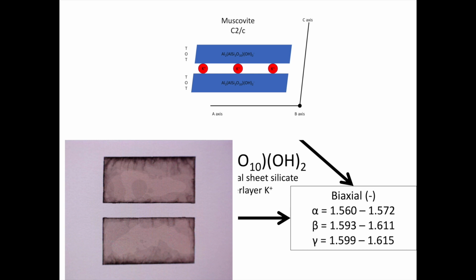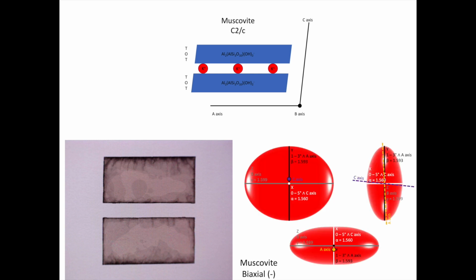However, it does not provide sufficient information to fully orient our Muscovite plates. For that, we also have to examine the optics. We first reviewed the theory behind our optical indicatrix for Muscovite, and then examined our oriented Muscovite plates with a polariscope in order to generate interference figures. The cleavage of our Muscovite plates, coupled with the location of the melatopes in our almost BXA interference figures, allow us to fully understand the orientation of these plates.